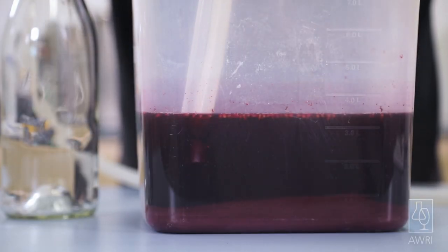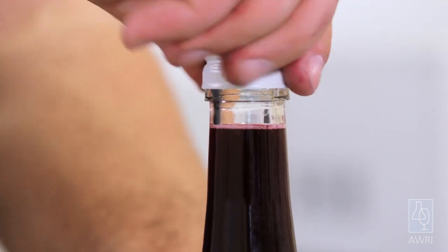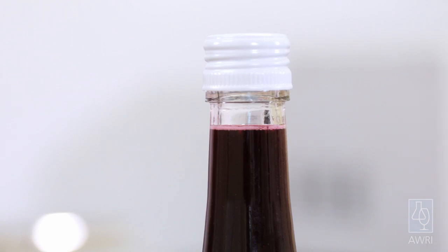Using a siphon, rack the clear wine from the container into a 750 or 375 ml bottle and seal with a screw cap. Make sure to fill the bottle to around two centimetres from the top to avoid potential oxidation. The wine is now ready for a sensory assessment for the presence of any smoke characters.